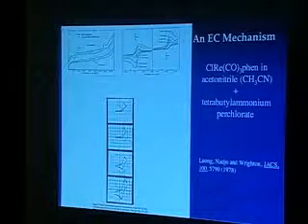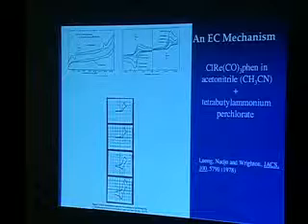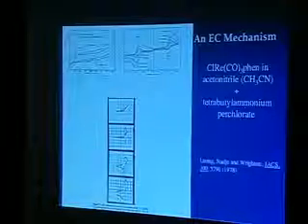And they published this paper in JACS on this. So the first thing we have is a relatively long-range scan rate dependence over here. I don't know if you can read the numbers, but +2 on the positive side. That's -1.5 over there, so almost -2 on the negative side. And at first glance, you'll notice this one right here looks pretty much like the ones I was just showing you: some kind of potentially reversible phenomena over there, and something that doesn't look very reversible over there.